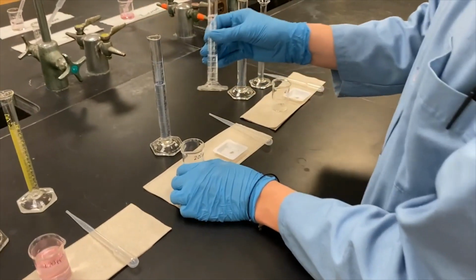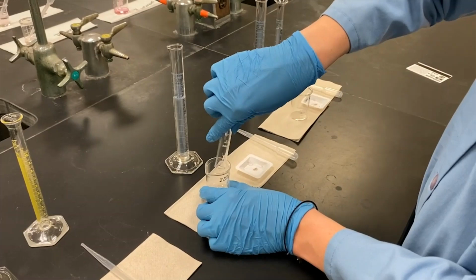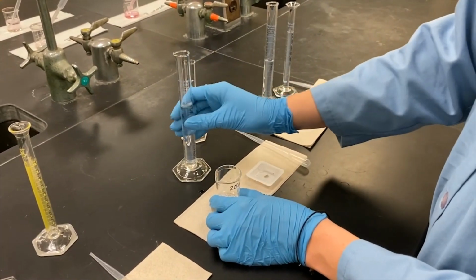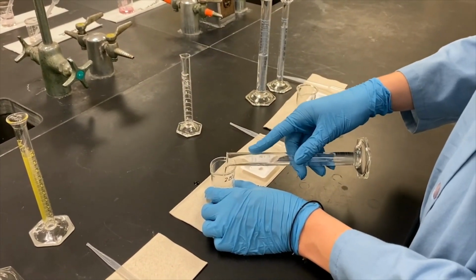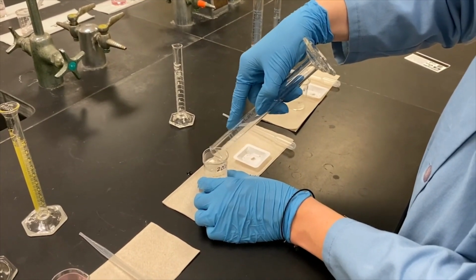Now to our 2 ppm, we're using 5 milliliters of the stock solution, and this can all be found in the chart in your PowerPoint slides or in your document background, experiment background.